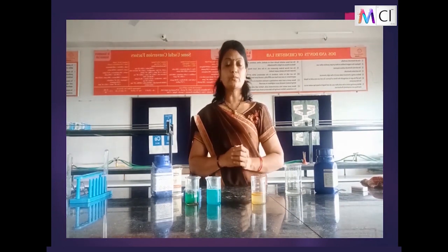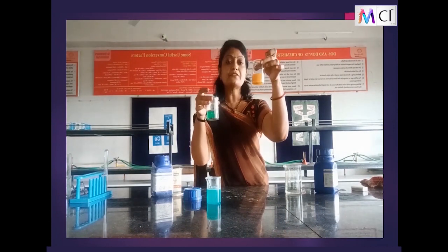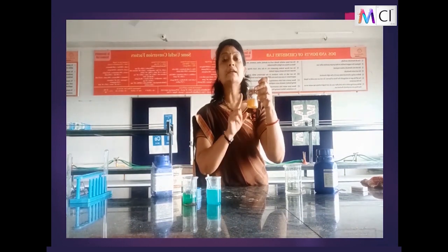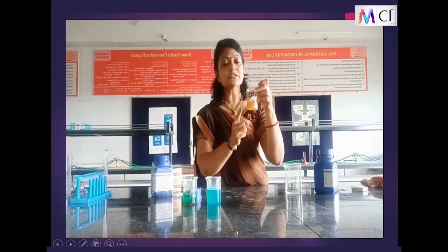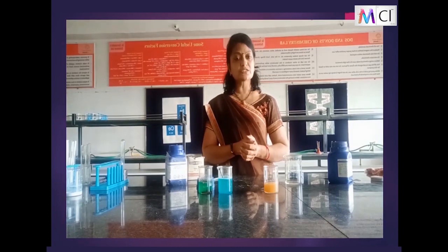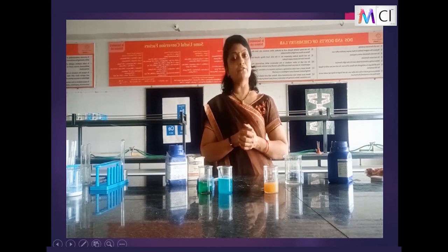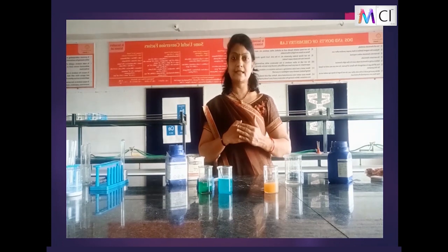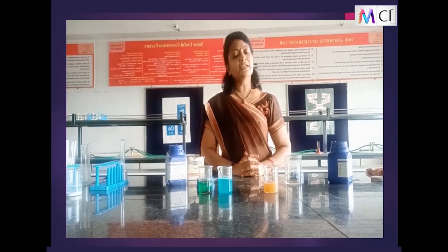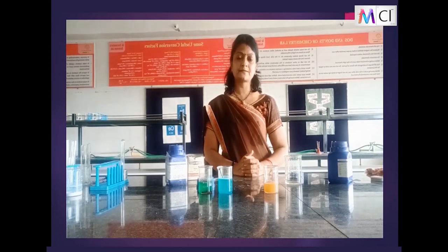And children, I know you must have understood now very well why there is a difference in these two colors. You can observe that ferrous sulfate crystals, when I have added in the water, come in contact with the air and lose their 7 water molecules, showing a drastic change due to the process of oxidation. So this shows that copper metal is less reactive than iron, so it could not displace the iron from its salt solution. And thus we can say that iron metal is more reactive than copper. In the similar manner, children, there are various reactions taking place, or experimentally it has been proved for the metal reactivity series.